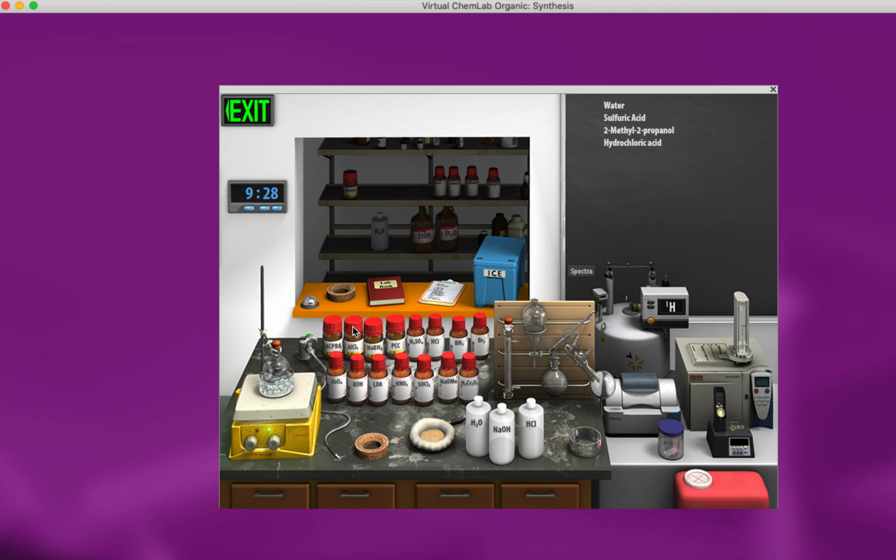Now that the reaction's done, we basically want to stop this reaction and work it up. So I'm going to drag the separatory funnel over to the flask. And now all the contents of the reaction are in the separatory funnel. For the reagent to quench this, you could probably choose a couple of different things here, but what I see is that I have acid formed. Since there's acid, I want to neutralize that, so I'm going to use sodium hydroxide and add that.